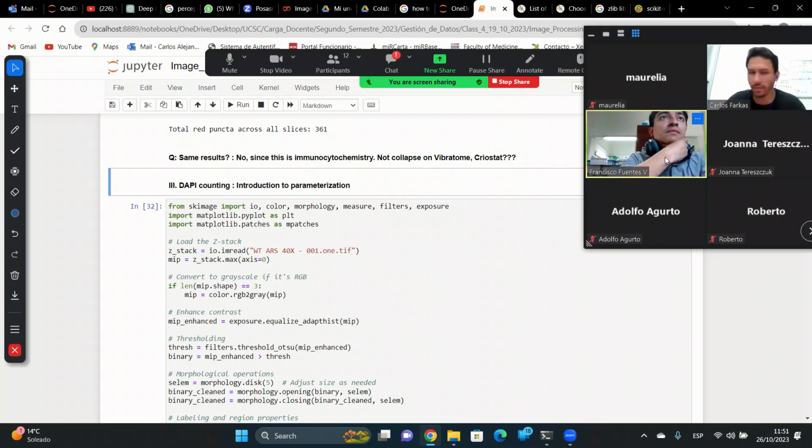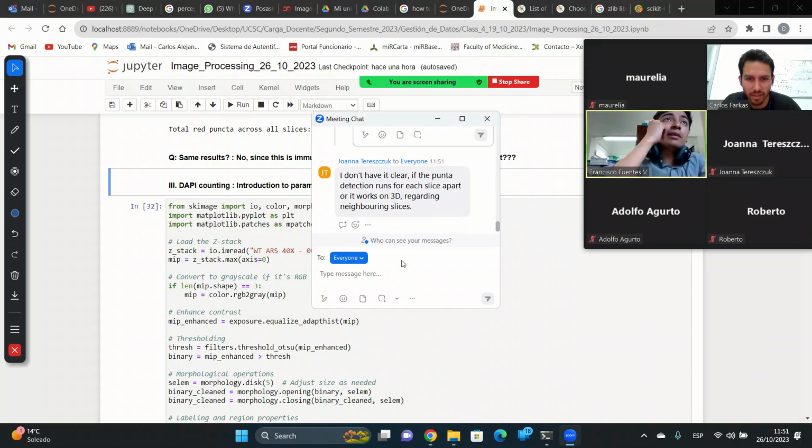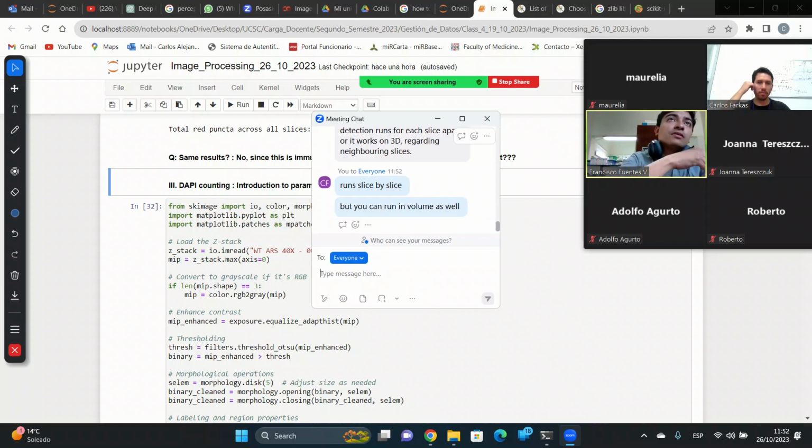Yes. Okay, so stress granule assembly is a biological process which is dynamically controlled. The stress granules are assembled step by step from a nucleating protein called G3BP1. So you have bigger and smaller spheres. These are three-dimensional, and they grow up and then they disappear also. So you will have different sizes.